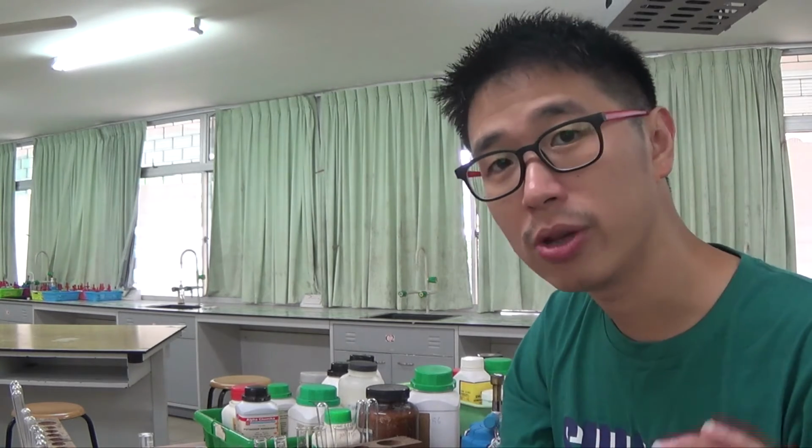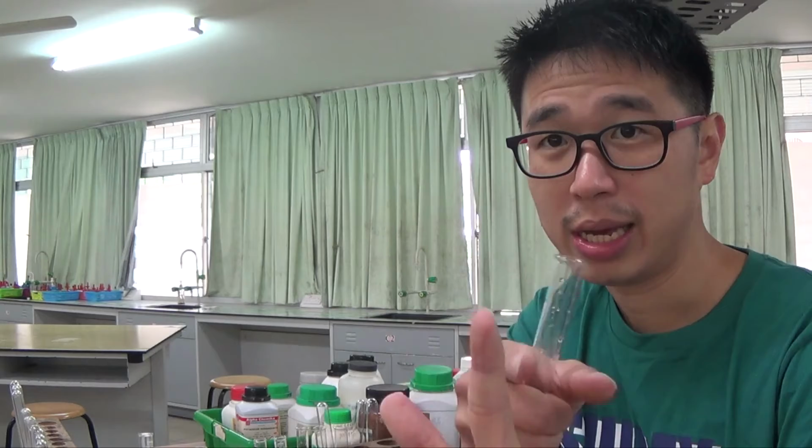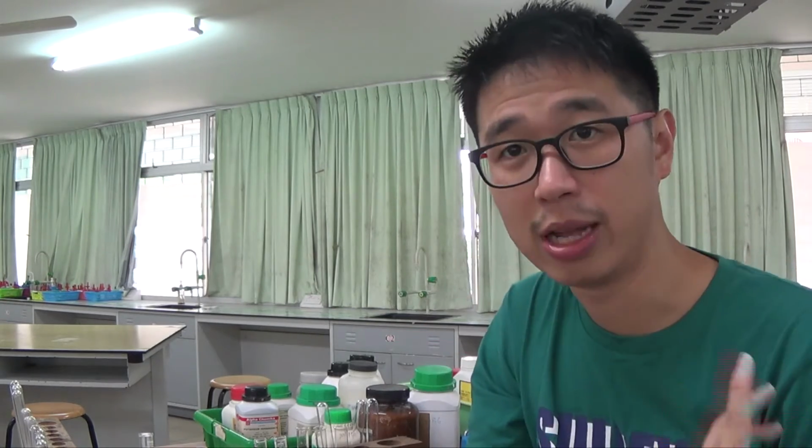Because in my other tutorial video on qualitative analysis, there's a compound called ammonium nitrate. Ammonium ion has a different test to testing for nitrate ion, but both of them will give you NH3 in their test. These are something that you will have learned from your O-level or GCSE or IGCSE practical, something that you revisit in A-level qualitative analysis.